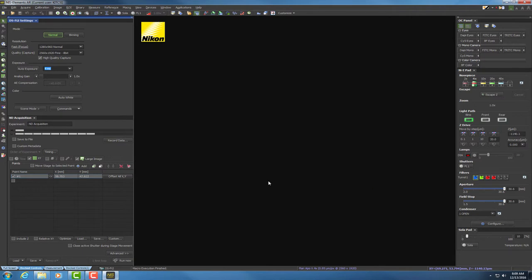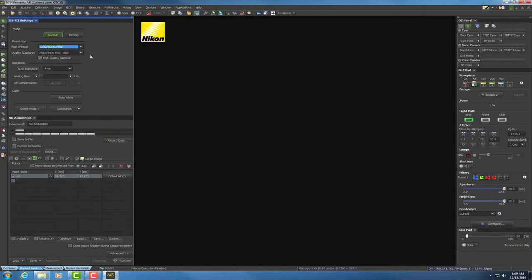First, we're going to look at fast focus in the upper left-hand corner. We want fast focus to be a lower resolution, so we're going to select normal. For quality capture, we want to capture at the highest settings possible, which is 2560 by 1920.